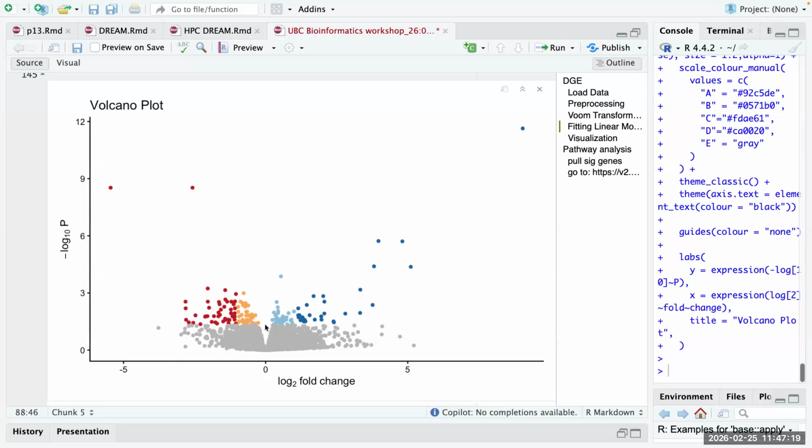And then the second cutoff is the log fold change. And log fold change is more of a way to show you how big is a change across two conditions. So the greater the absolute value, the greater change across the two conditions. So fold change is not necessarily changing gene expression, but it's like a part of it. Okay, great.